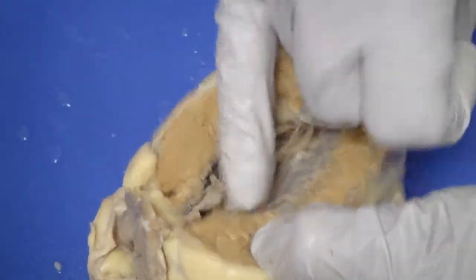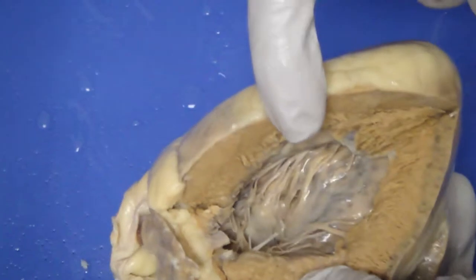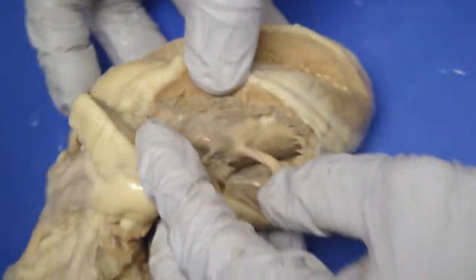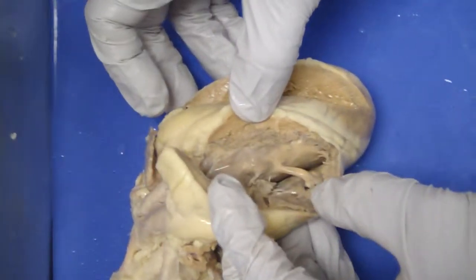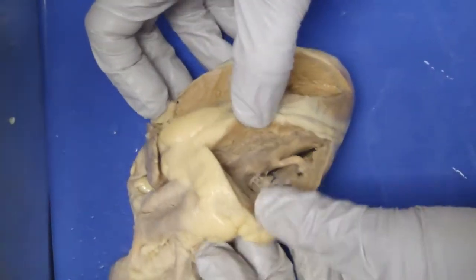There's a cusp right there. So this would be the mitral valve. Bicuspid. Over here, trabeculae carneae, moderator band, papillary muscle. Not so easy to see the papillary muscle.